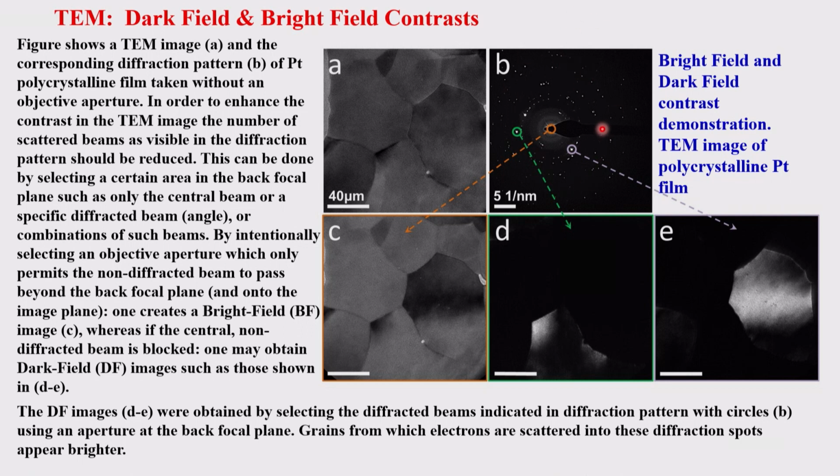Already you've seen in the previous slide, the right side one is the unit which is made. But these are not different TEM machines. The same TEM machine can be adjusted to get what you want. So in this, you can see different regions: the regions of the center, the regions of this green one, the regions of this one.